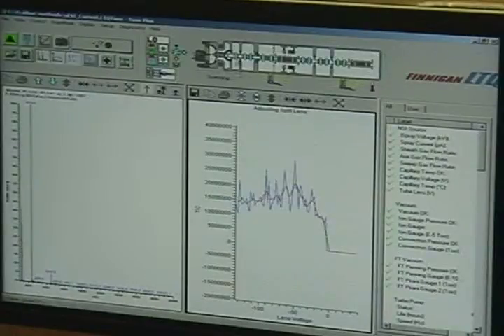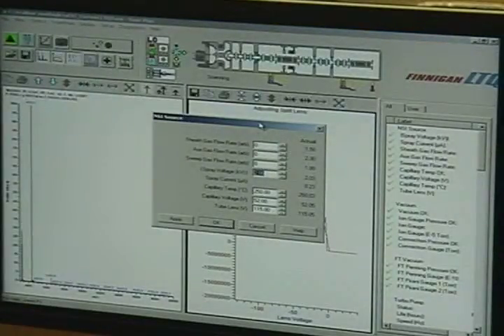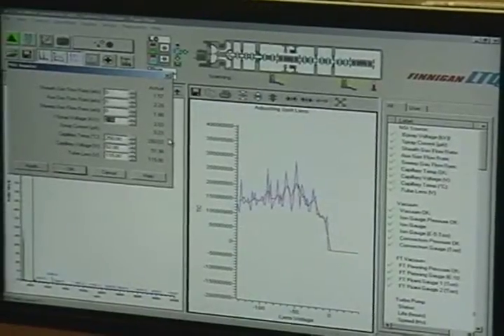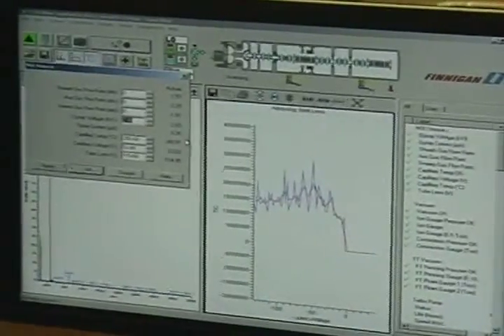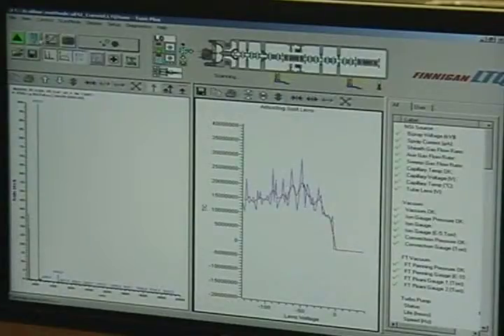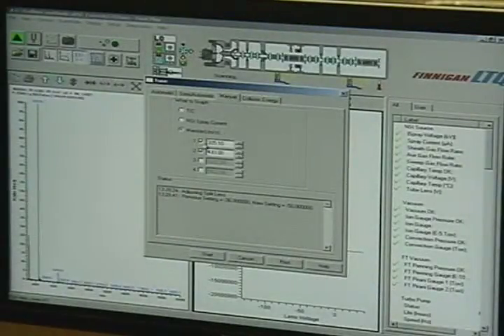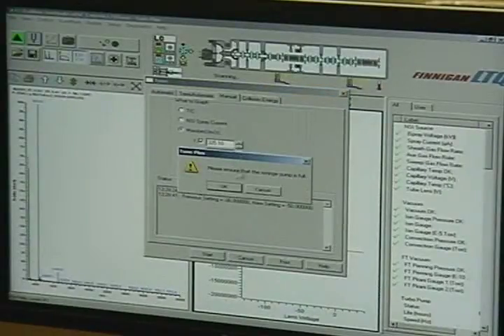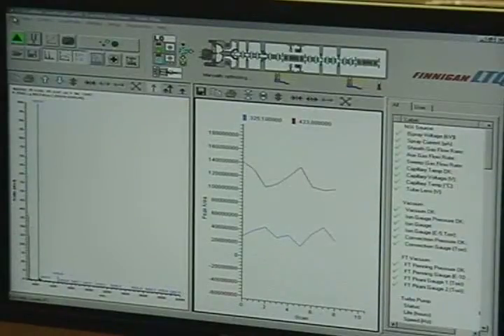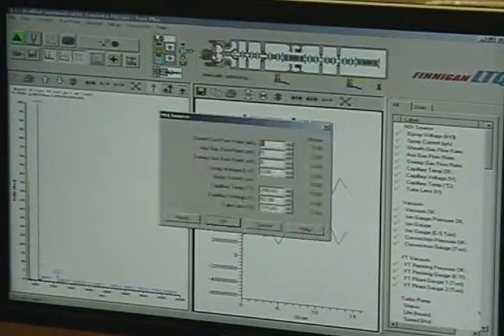You could vary your voltage if you wanted, but this is what you use for your run, 2 kV, right? Well, I can use whatever is good. I think so. The key is you would want to vary this with the exact same conditions you're going to run with. Okay. So capillary temperature, you could try 200, 275. It's up to you. I found it never makes any difference, but why don't we monitor something? Monitor the 325 and the 433 and see what they look like. This is something you do once in your lifetime to see if it makes a difference because it's painfully slow.